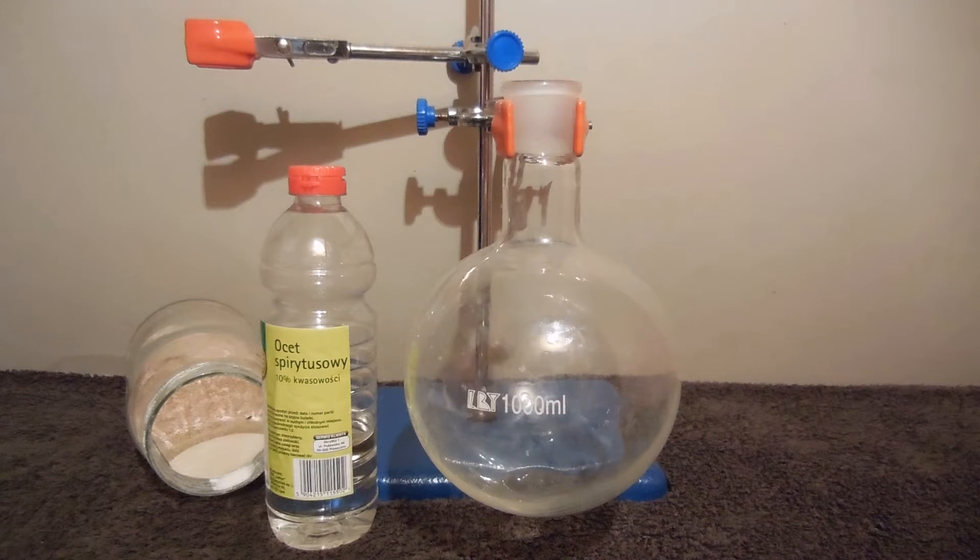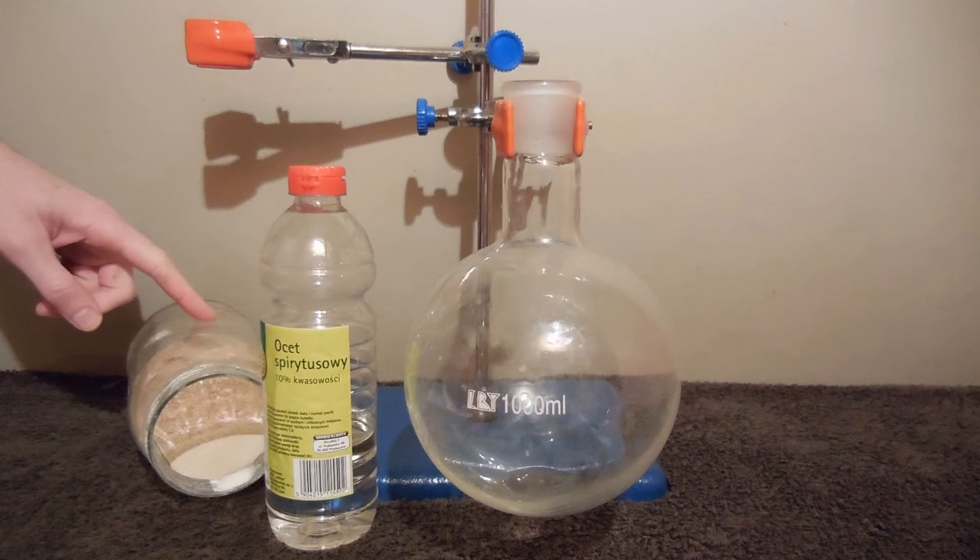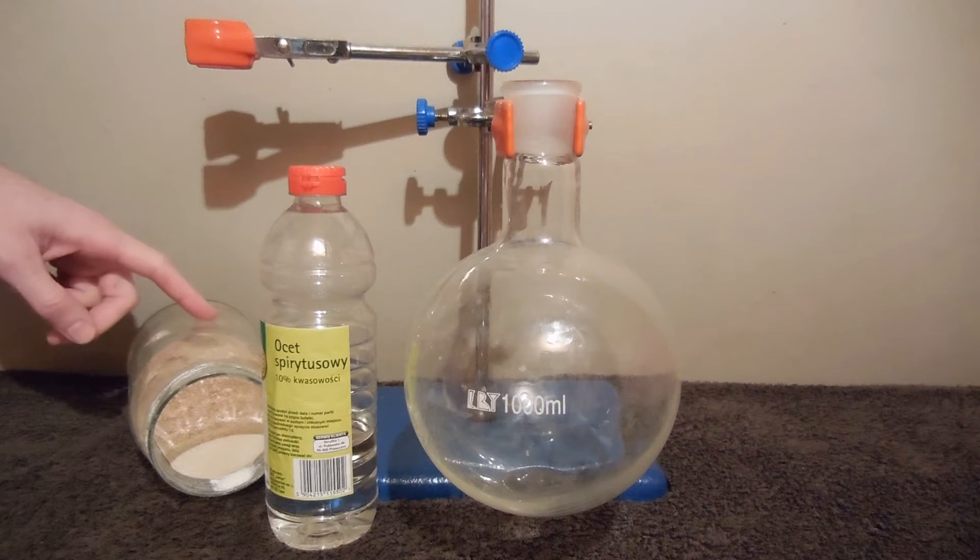Hello. In this experiment I will show you how to make calcium acetate. In this container I have calcium carbonate made from eggshells like I showed in a previous video. It's a bit contaminated by the eggshell membrane which is protein.